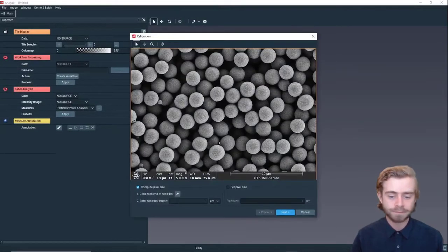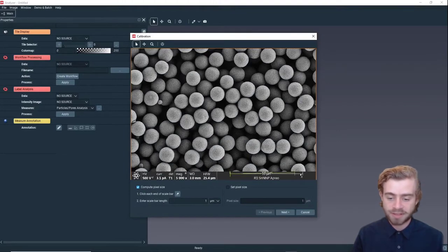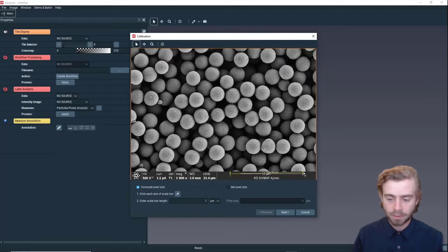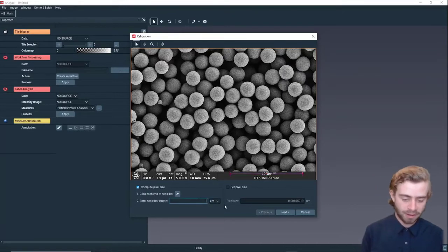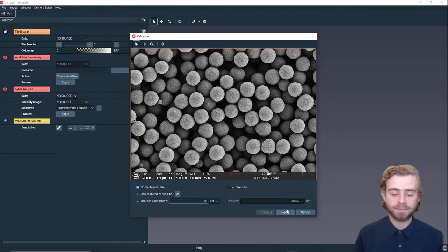Click Open. Next we're going to set the resolution to the scale bar of the image, and then we're going to set the scale bar length to 10 microns, because that's what it says right here.